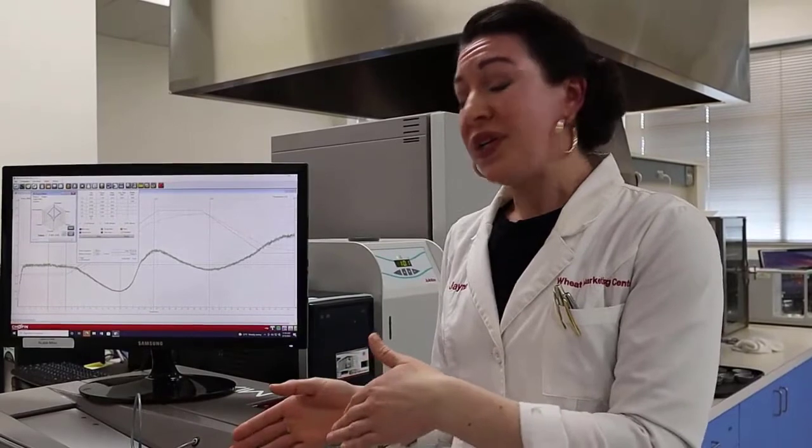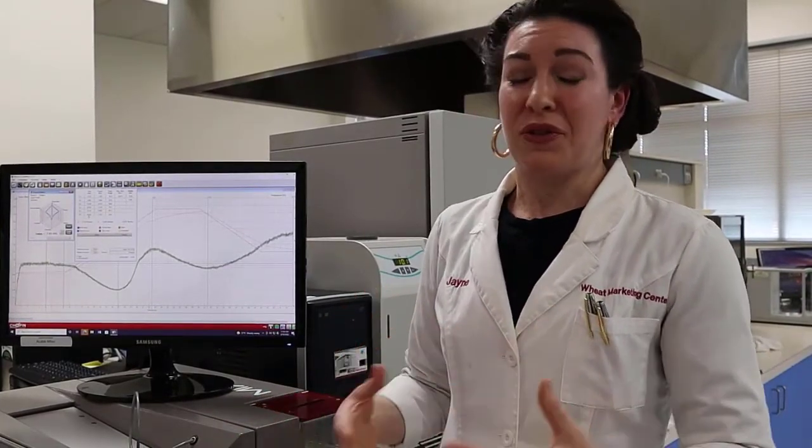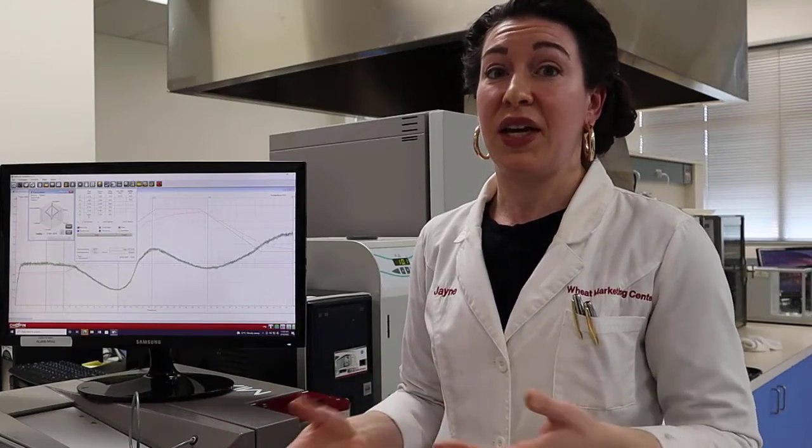Dr. Jane, can the MixoLab offer up a new approach to quality control for bakers? So the MixoLab 2 actually has a new accessory called the dough kit. And so what bakers could actually do is they can actually pull dough from their processing line. They could pull it out of their mixer. They could pull it at a different step in the processing. Put it into the MixoLab with that dough kit and then get a more fundamental or complete understanding of what their dough behavior is like in real time. And you can make corrections on the fly based on how that dough is performing with the dough kit.